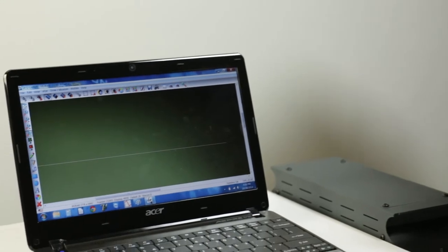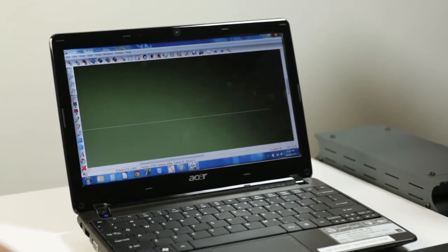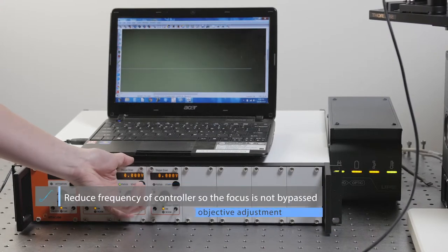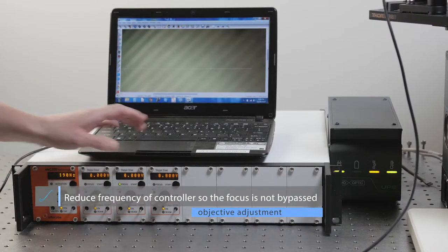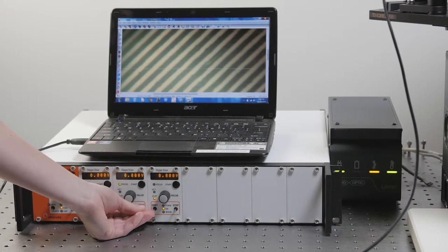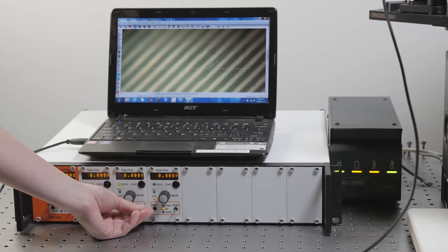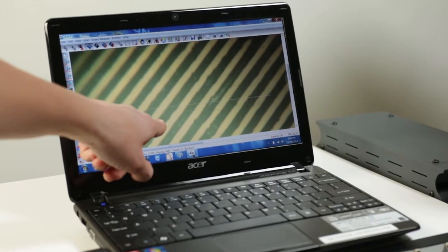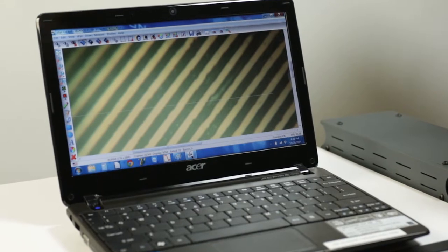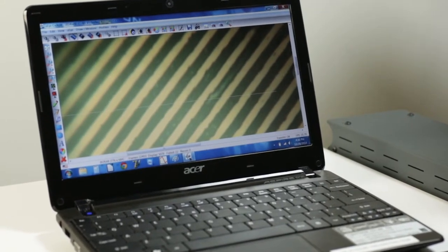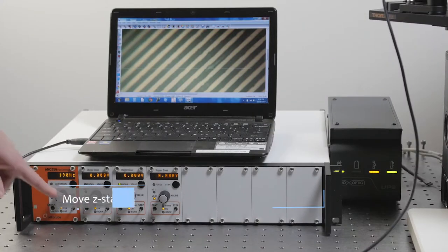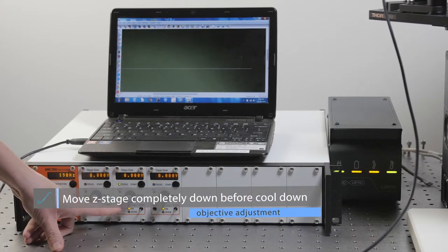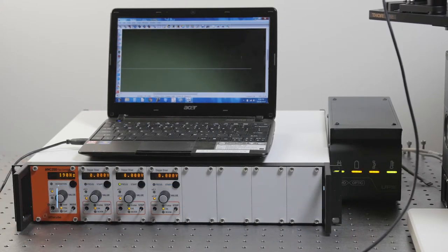We'll bring the sample into focus by moving up the Z stage and we've moved the frequency of the stage pretty low and it's pretty easy to bring it into focus. Each trough width is 3 microns and it looks pretty good so now we're ready to cool down. Before we cool down we'll move the Z stage all the way down so as everything contracts, the aperture doesn't collide with your sample.